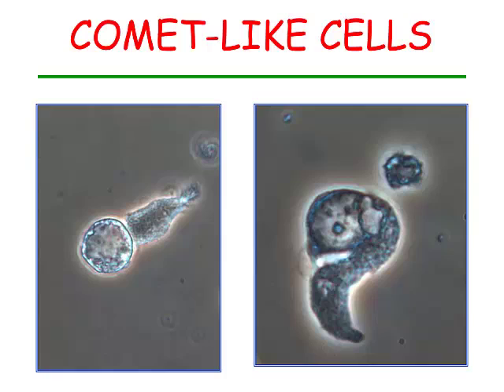So these cells can be very easily identified with phase contrast microscopy without needing any stain, any special procedure, and without the need to involve a cytopathologist. We don't have anything against cytopathologists, but for instance, cytopathology is not always available, is not present in every hospital, you know.